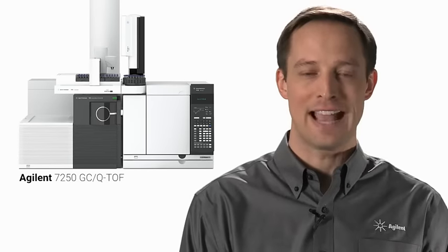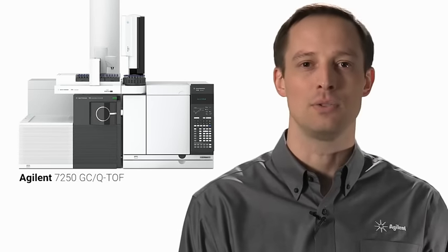What if you could achieve enhanced molecular ion with the universal ease, simplicity, and applicability of GC-MS electron ionization? In this Innovation Minute, we will discuss low-energy EI for the Agilent 7250 GC-QTOF.